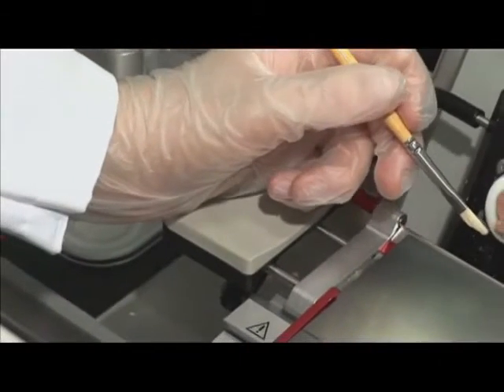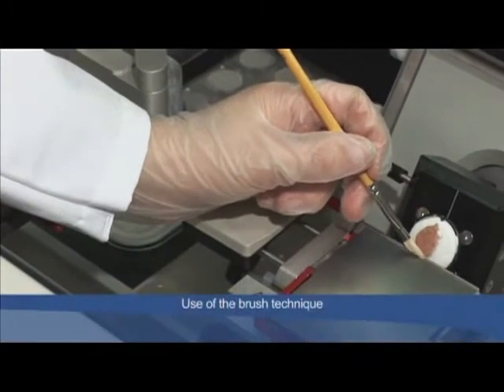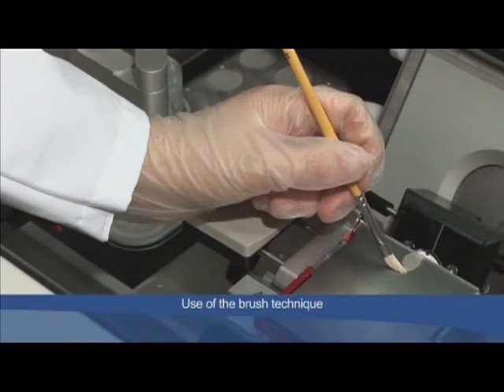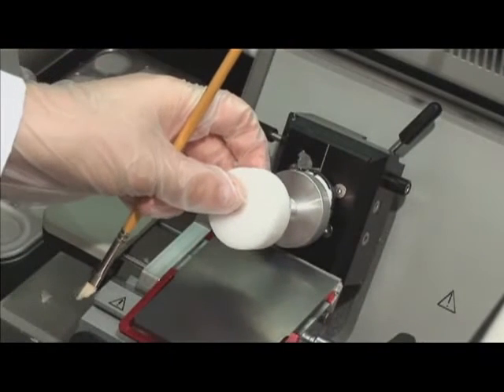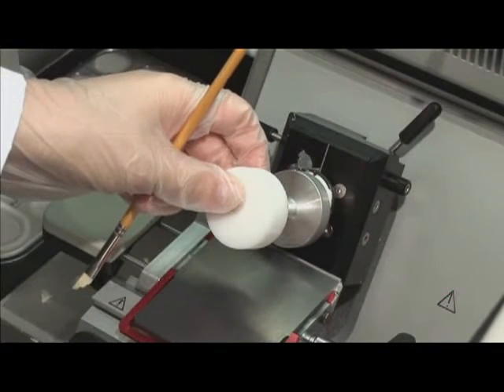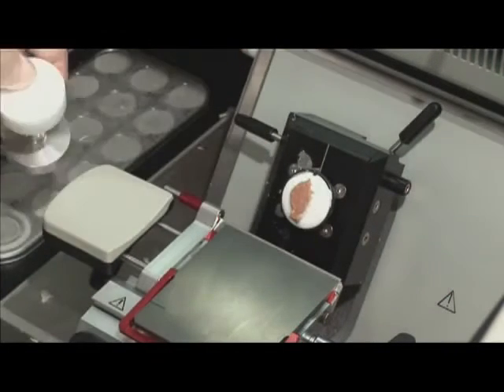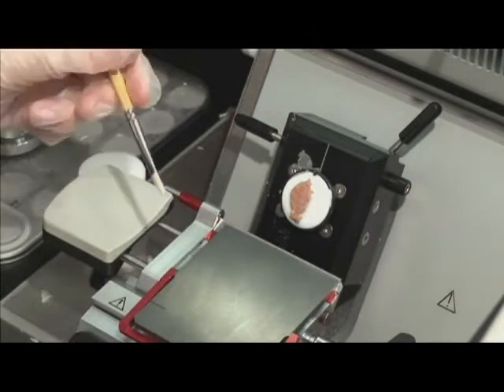A palm rest attached to the blade holder CE allows comfortable use of the brush technique. Instant temperature reduction directly at the object can be obtained by holding the pre-cooled metal side of the heat and cold extractor against the specimen.